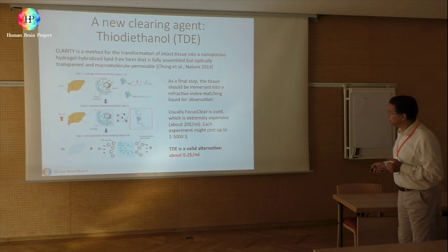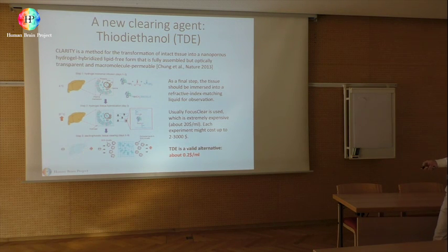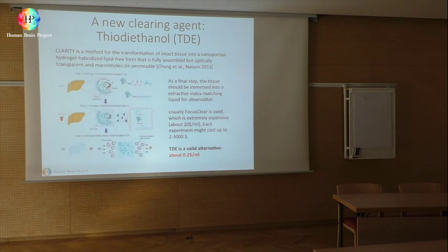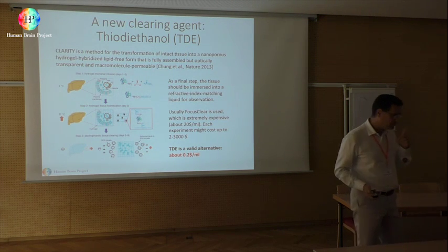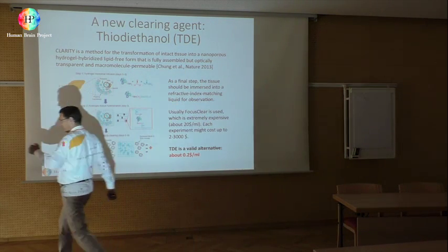And as I was telling you, we can apply TDE. This was a measurement made with TDE in the transgenic mouse, let's say pre-labeled, because it's transgenic GFP. But we can use TDE also with Clarity, and the nice news here is that we can make post-mortem labeling.